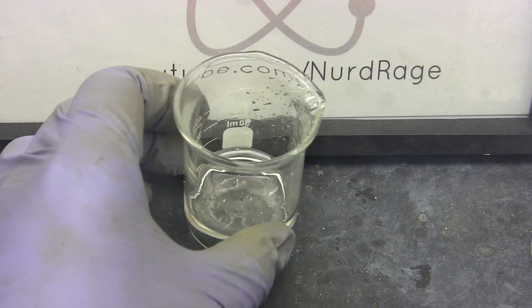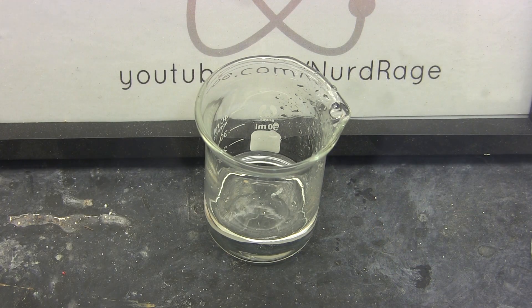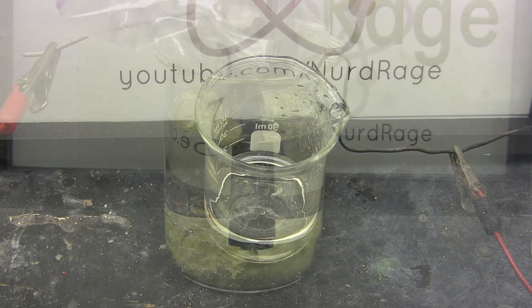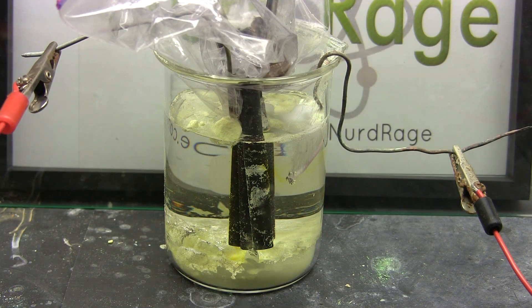The final yield from 16g of sulfur was 21g of sulfuric acid. While not very good I'm sure improving the quality of electrodes and preventing the tribromide ions from reacting with the cathode would help.